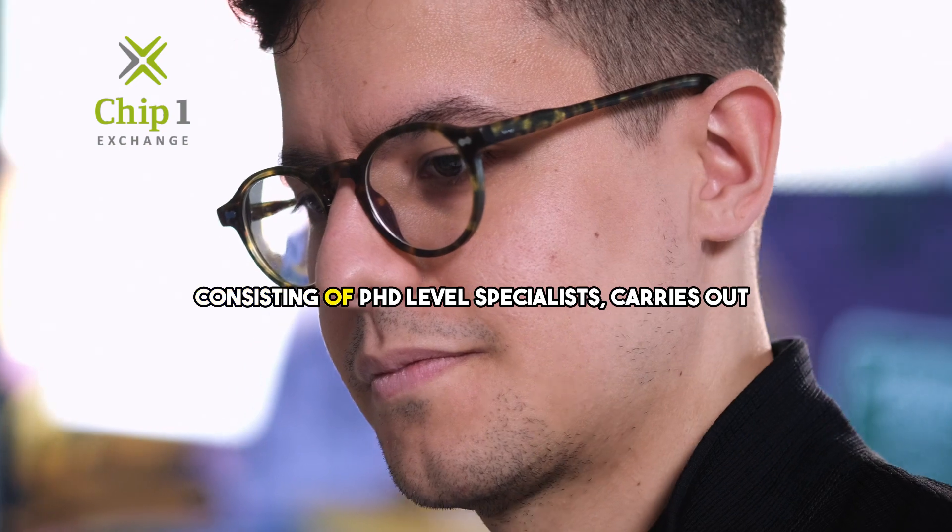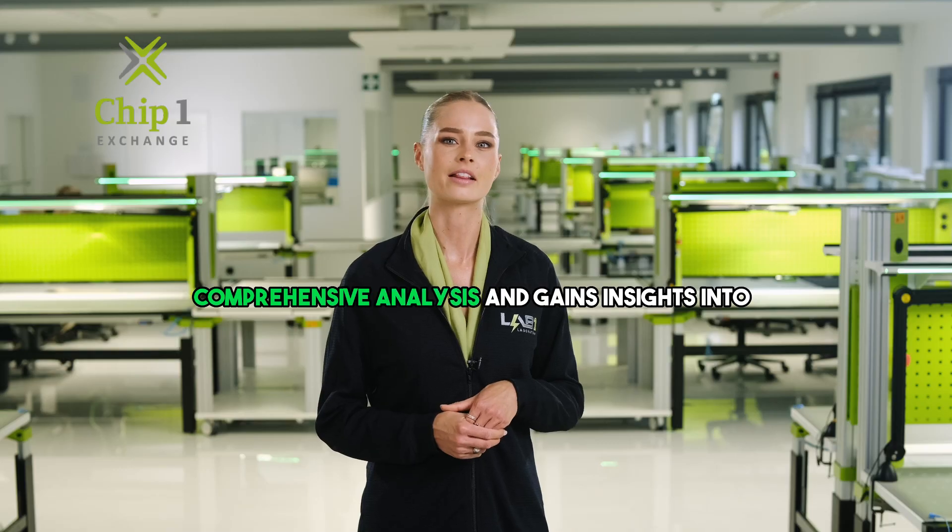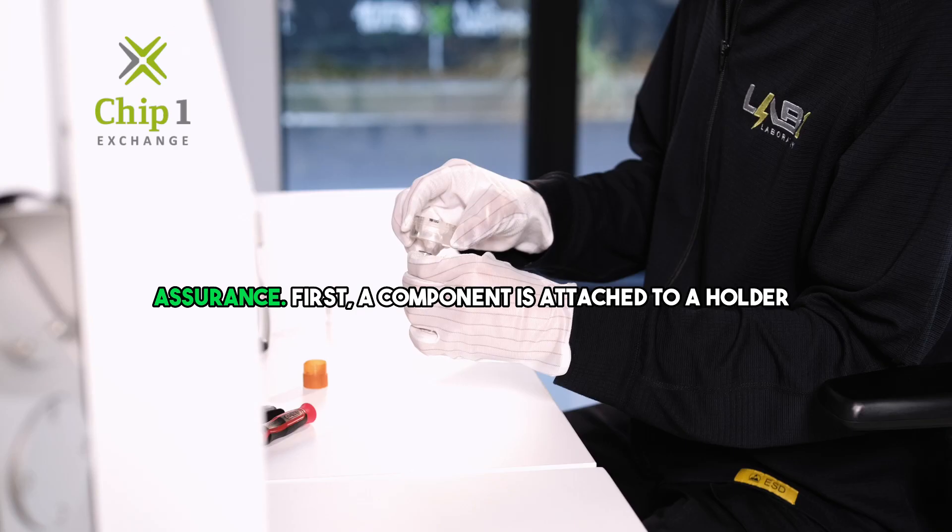With SEM EDX, our experienced team consisting of PhD-level specialists carries out comprehensive analysis and gains insights into material structure, which are crucial for quality assurance.